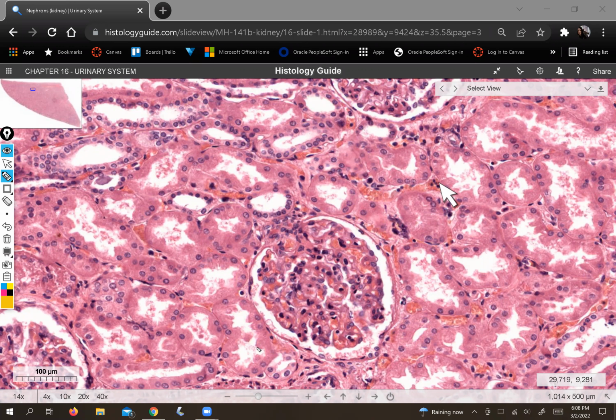So whether it's a cortical nephron or a juxtamedullary nephron, they both have their corpuscle situated in the cortex and not in the medulla. So if you look at a slice of kidney and you see this very distinctive shape, and you can even see it from low magnifications because you'll see the little crescent shape of the capsular space, you can be sure that you're looking at the cortex.